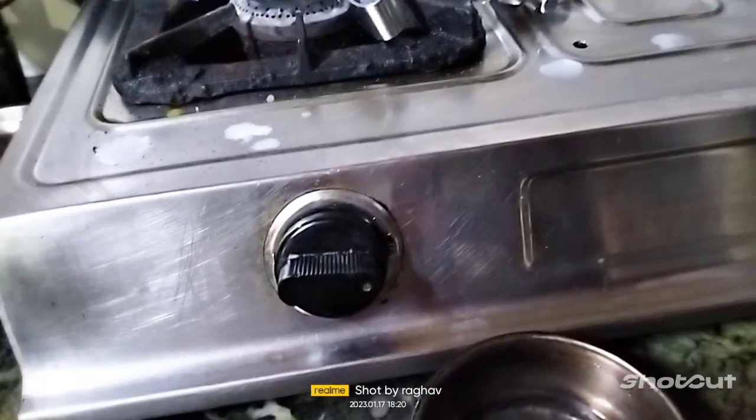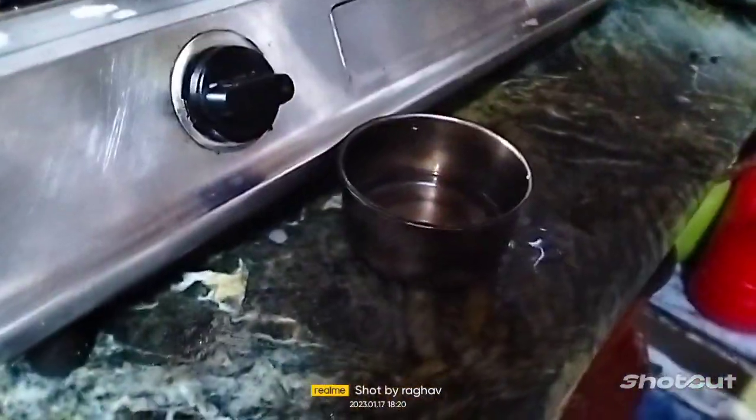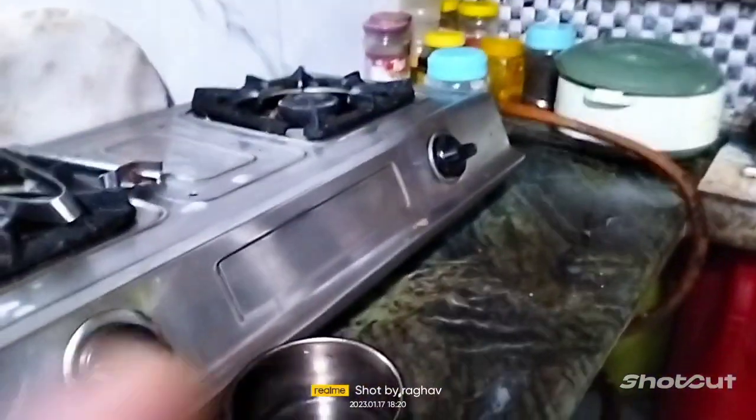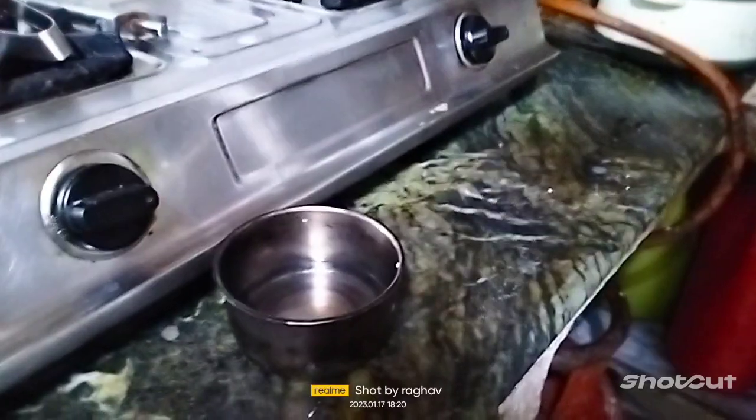Aldose group is joined, and ketone also. So I am making the video. Now I pour the glucose on acetic acid. Now you see here.